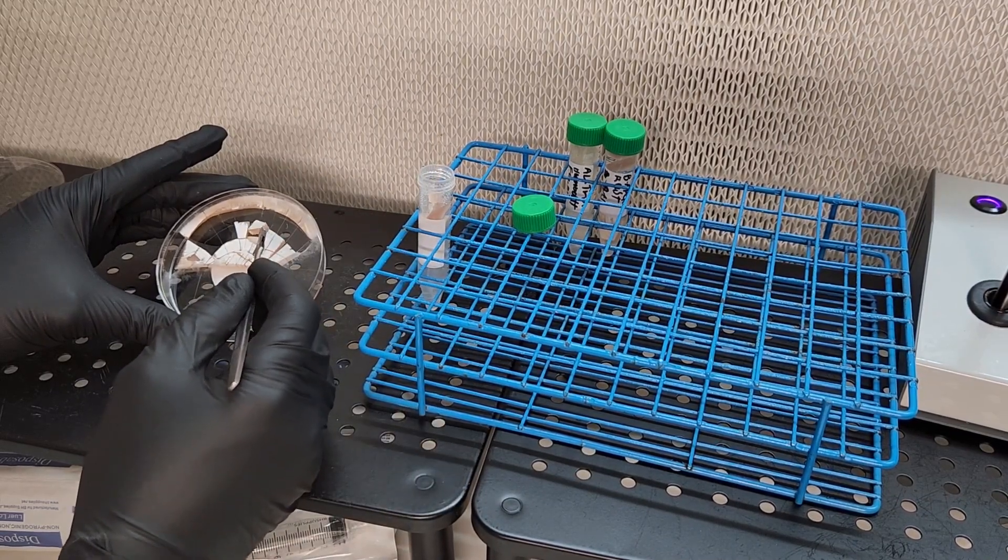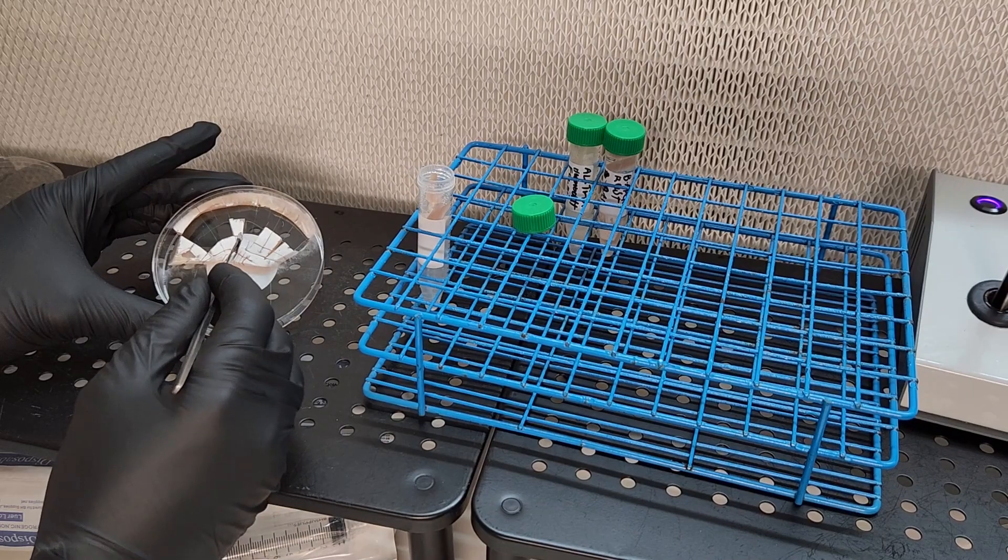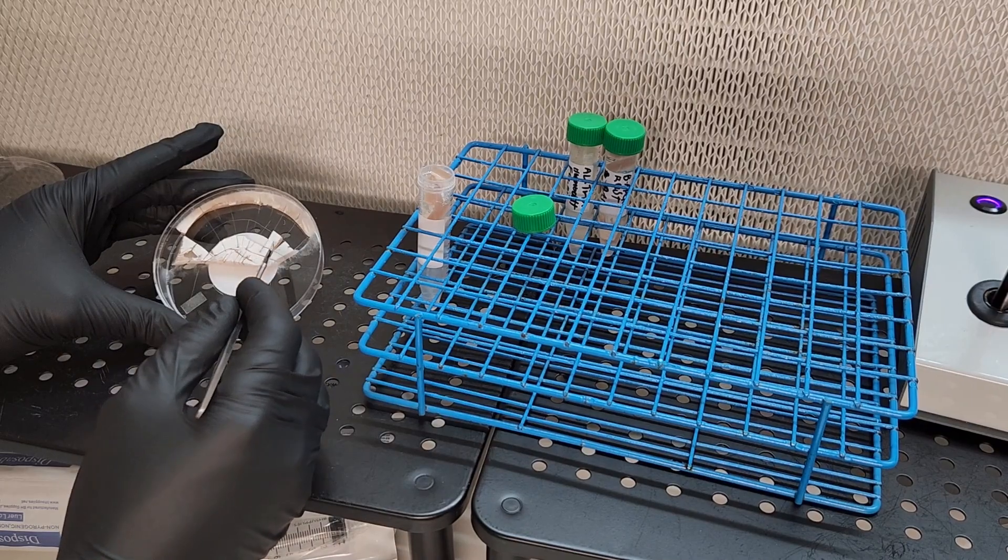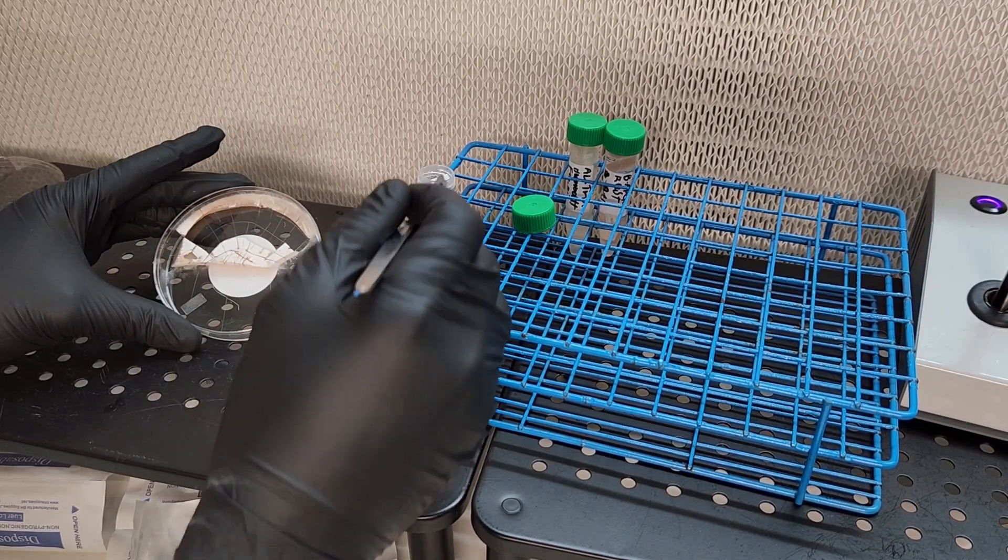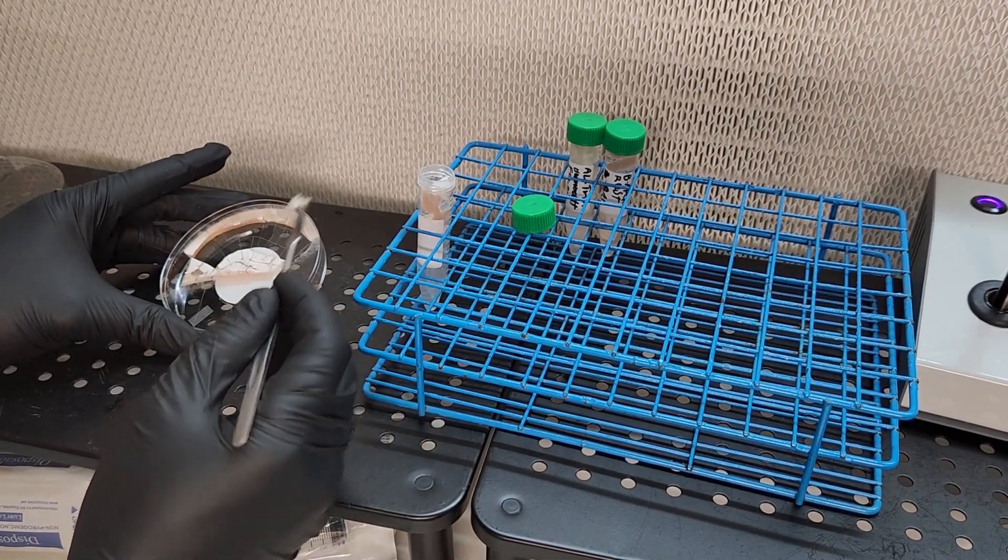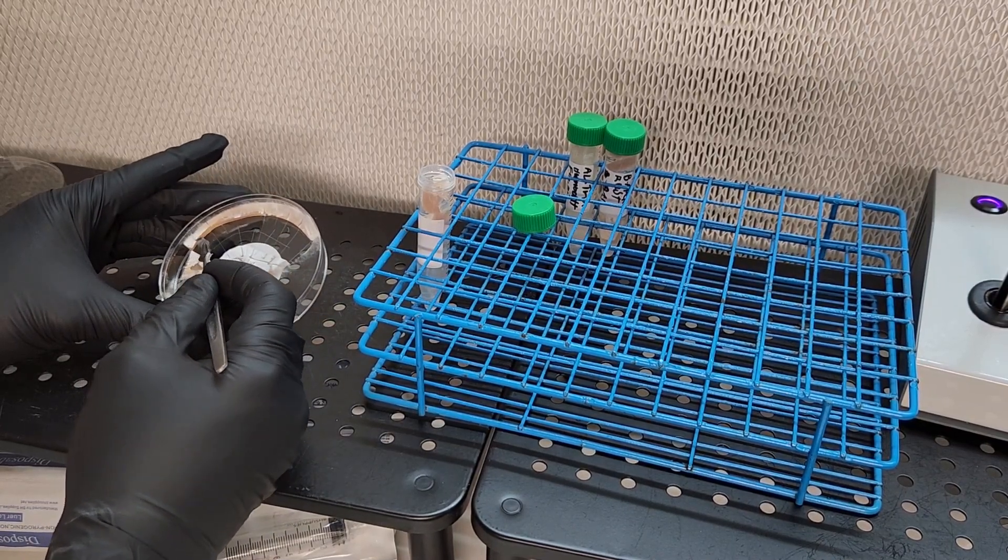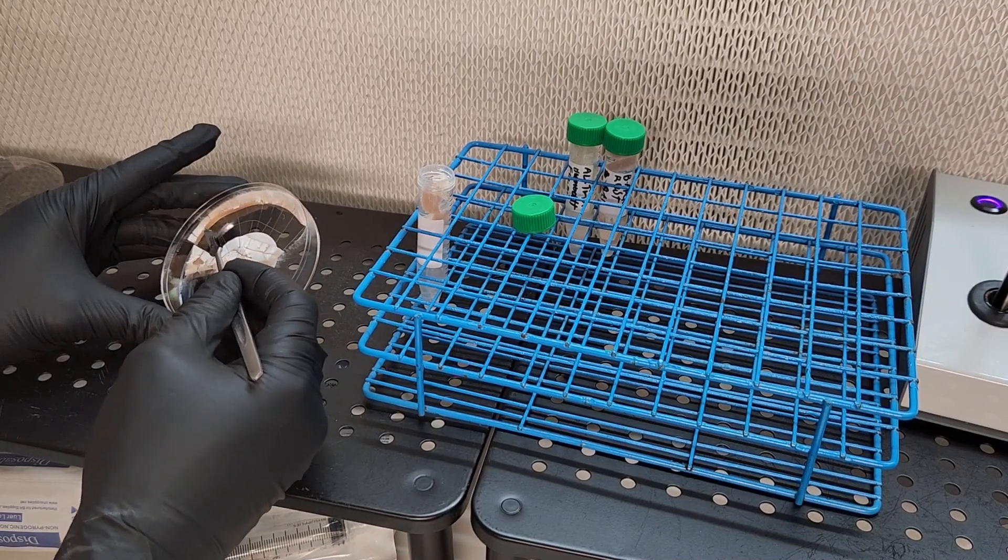Here you can see I'm simply taking my scalpel, cutting transfers, and transferring them directly into the sterilized distilled water. I filled the slants to about eight milliliters as these are ten milliliter vials. As I add these transfers into the vial, it will raise the water level until there's almost no headroom.